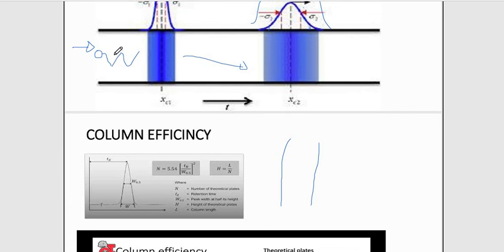And when I say equilibrated, it's more like the analyte is being absorbed by the stationary phase and dissolved into the mobile phase. So this mechanism of absorption and adsorption occurs at a very discrete distance for each particular analyte. So for every analyte, it has its own discrete distance which is constant, in which the analyte itself is absorbed and dissolved within the chromatographic column.